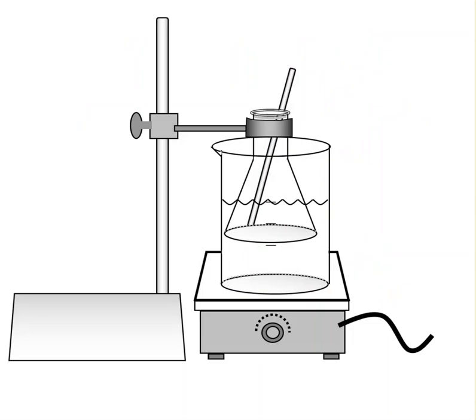Next, we're going to dip our reaction flasks down into some warm water, and the water will be about 75 to 80 degrees Celsius. The reason that we put it in some warm water is because that will speed up the reaction if we warm it. We don't want to go too hot though, because if we do, when the aspirin crystallizes, it won't be in little powder crystals. It'll be kind of waxy and it will be hard to separate and get dry.